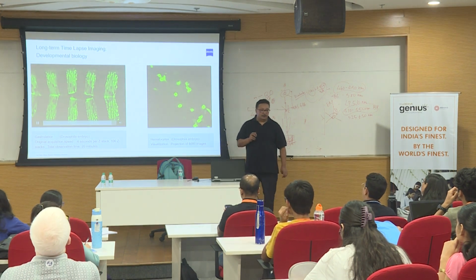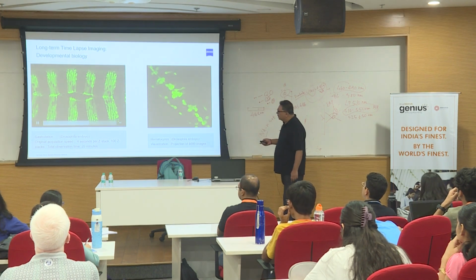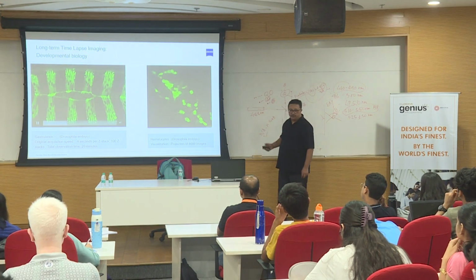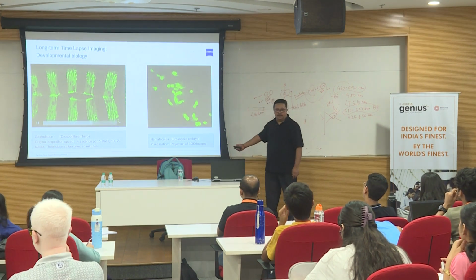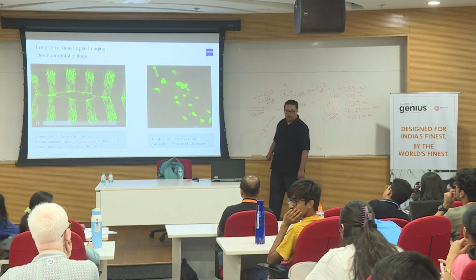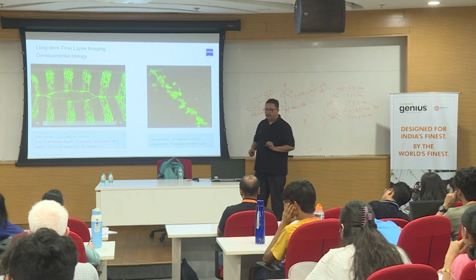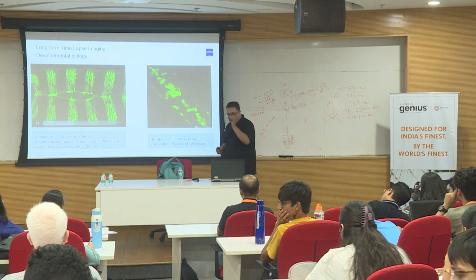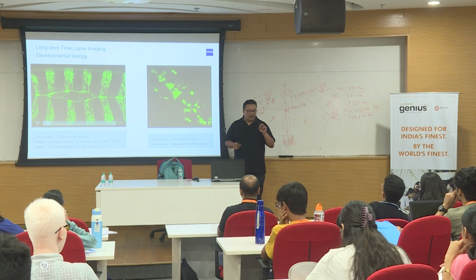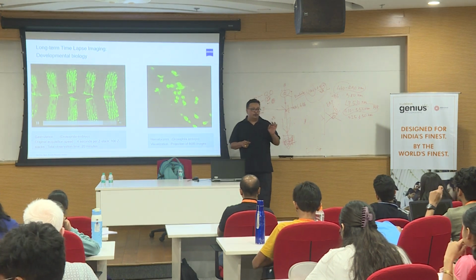And the laser falling continuously on the sample. If you see over here, the time data has changed. From 20 minutes, it has gone to 3.5 hours. And this is 8,000 images. So for 8,000 images, again 20 Z-stacks and 400 time points. For all these 400 time points, the laser was activated, the laser was falling on the sample, the detector was collecting the emission, and the sample was stable enough and the laser was at optimal power so that there was no bleaching happening.